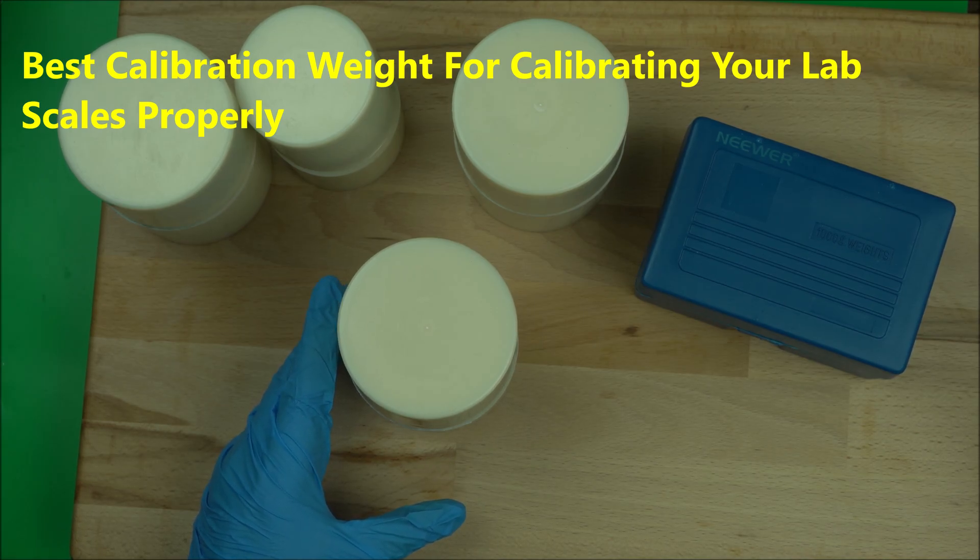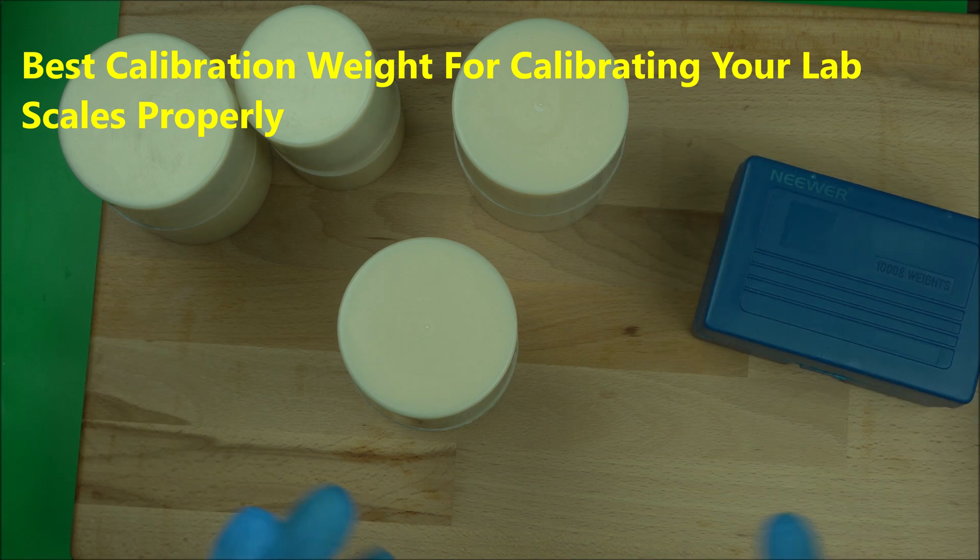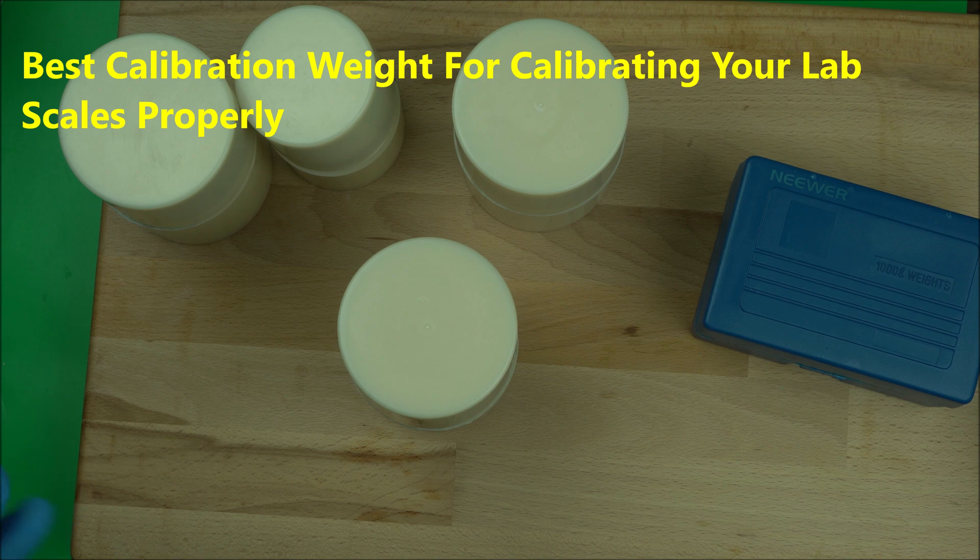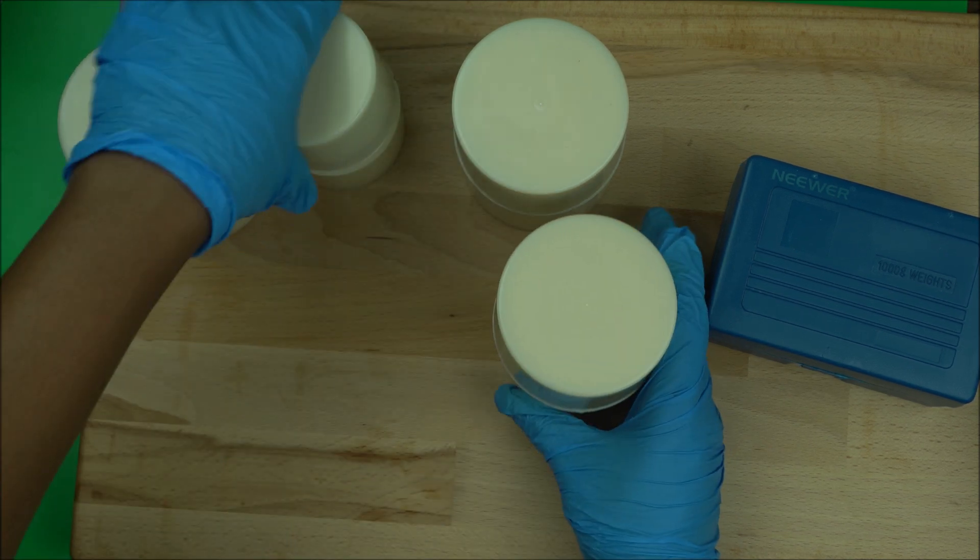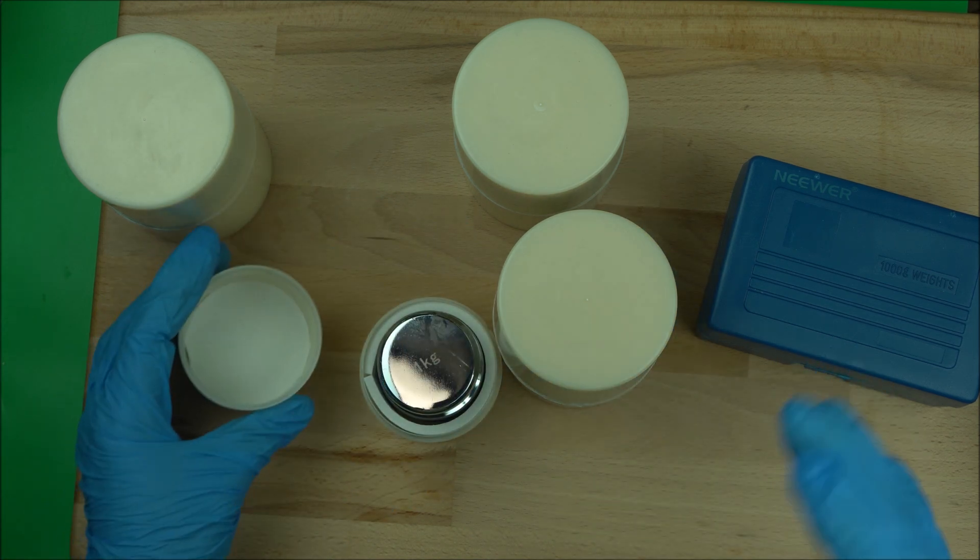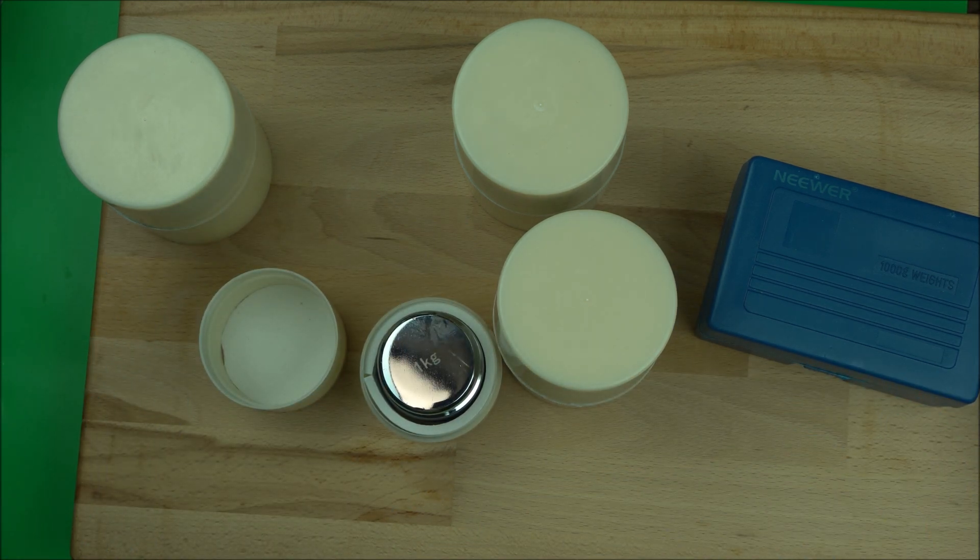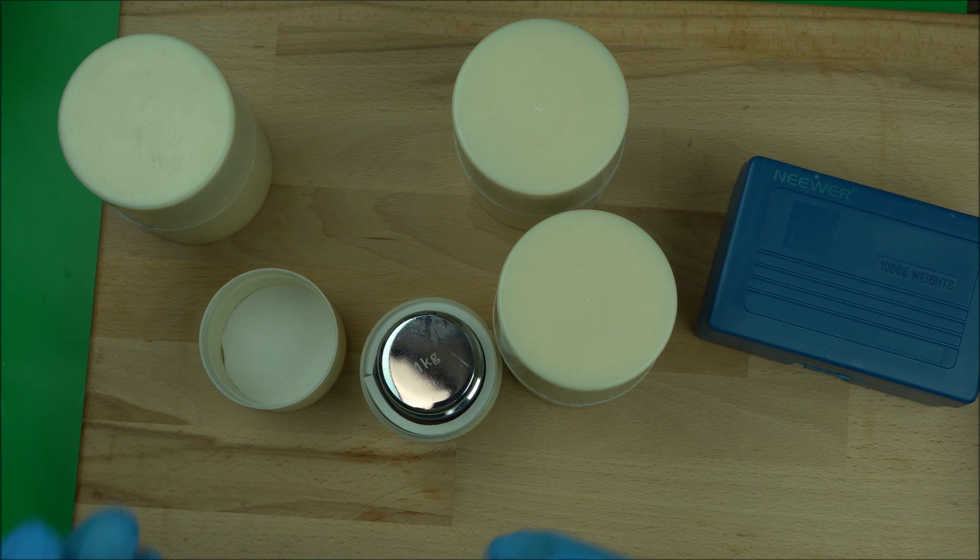Hello everybody, welcome to the channel. In this video I'm going to show you my best calibration weights. As you all know, if you make beauty products to sell, you need to have a calibration weight. Another name for calibration weight is calibration mass. This is what you use to calibrate your scale.